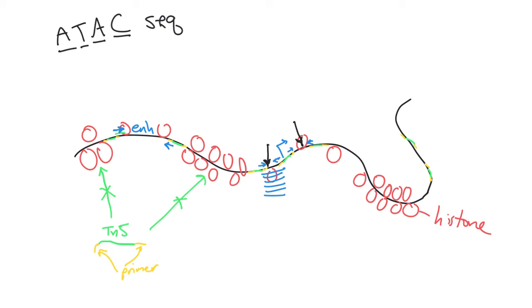And so that makes lots of copies of those regions of the genome between the primers that were inserted into the euchromatin, because they are primer sites that are in this engineered transposon. So then those PCR products are sequenced, and that gives us the sequence of the DNA in between the transposon insertion sites that are part of euchromatin in this chromosome.